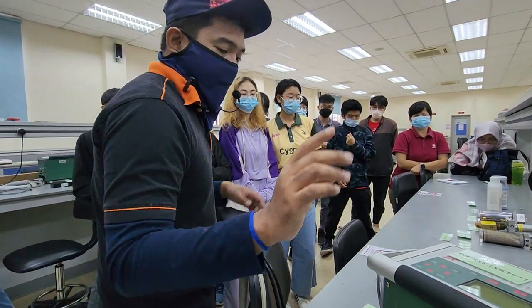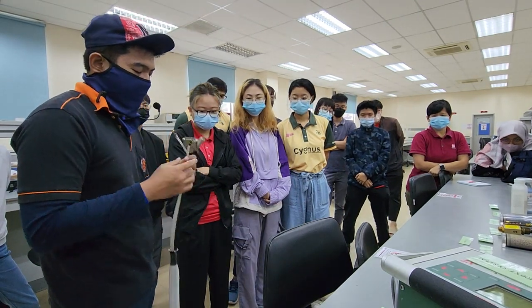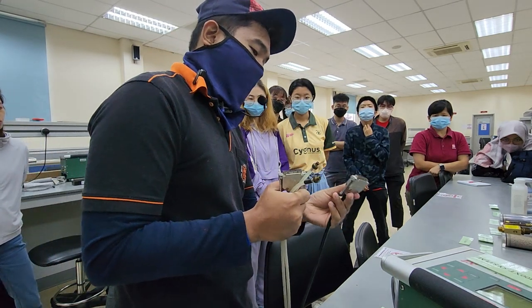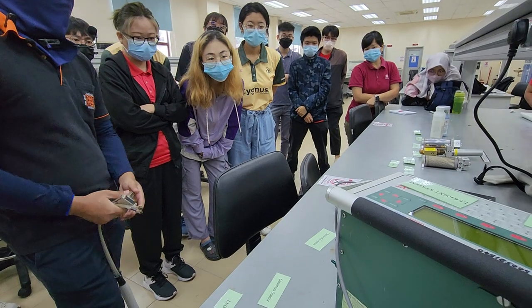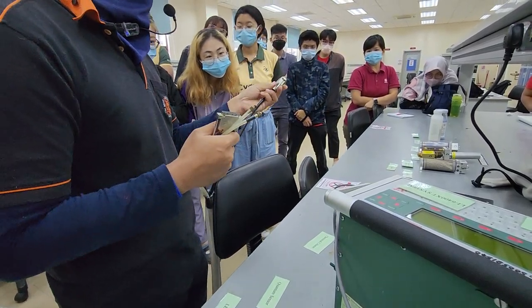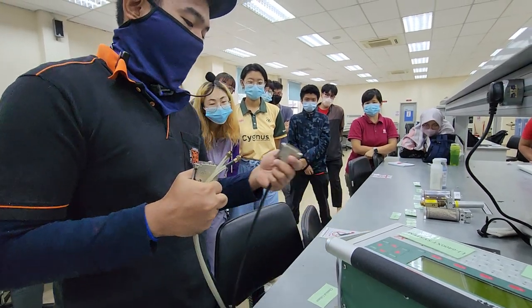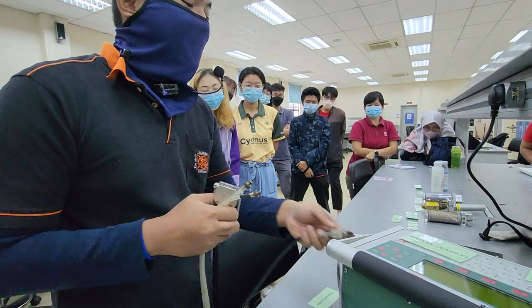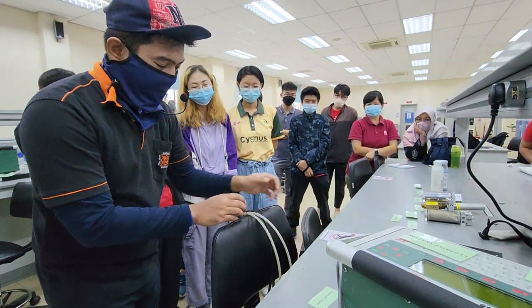Okay, let's go to the next part, which is the cable here. This cable, you need to fit into it. Is this male or female? Female. So you should find this here. Why doesn't it fit? It's a test. You will connect that later. I don't want to do it now.